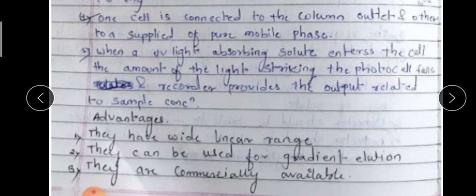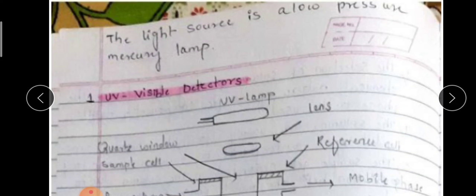What are the advantages? They have a wide linear range. They can be used for gradient elution. They are commercially available. Here the UV source or UV lamp used is nothing but a low pressure mercury lamp.